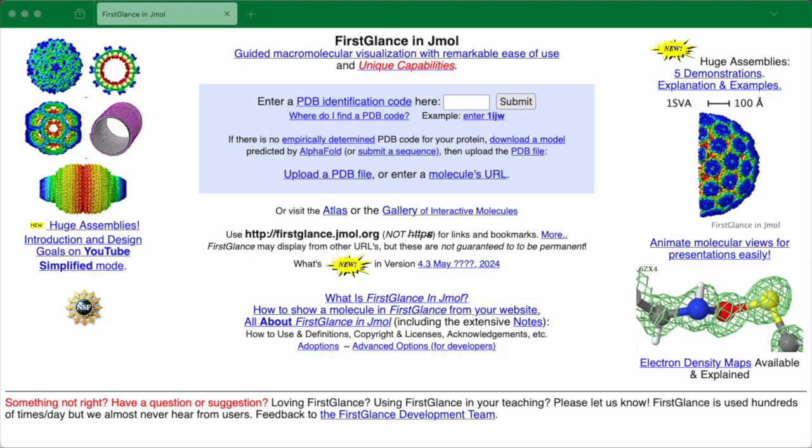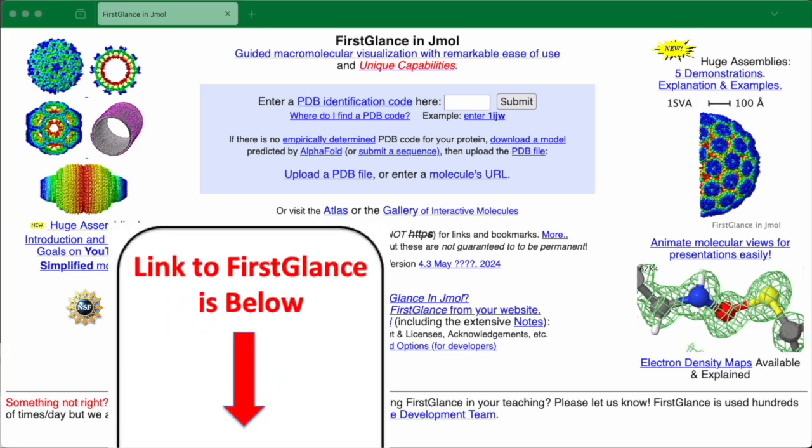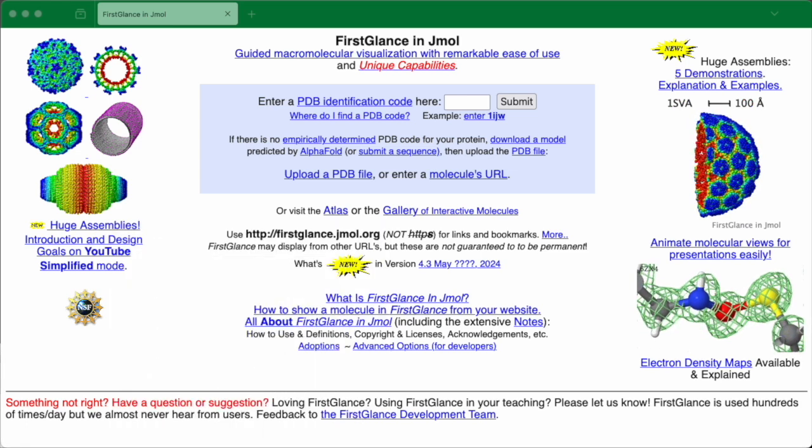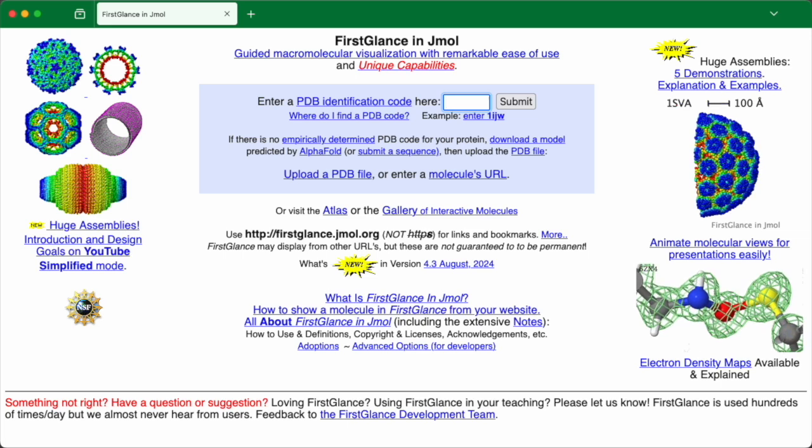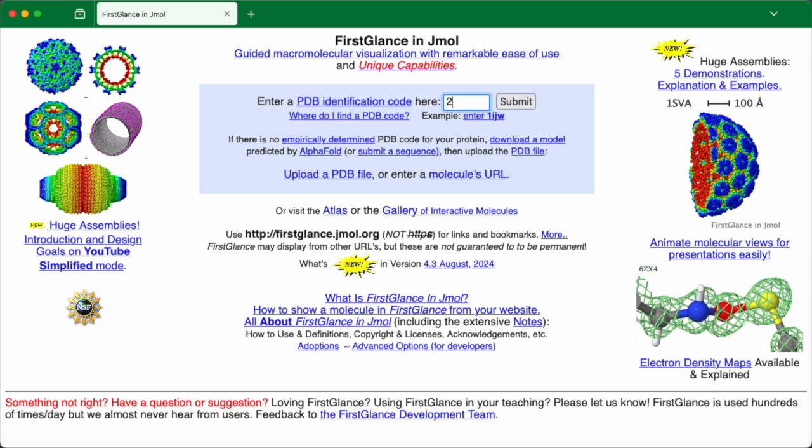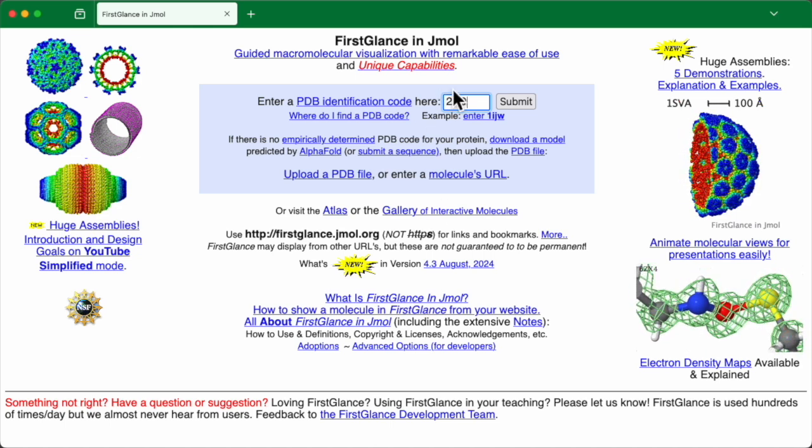This is the front door to FirstGlance. Use the link down below this video to find FirstGlance and then bookmark it. Our example will be 2xi9. So I'll enter 2xi9 in the slot right here and press Enter.